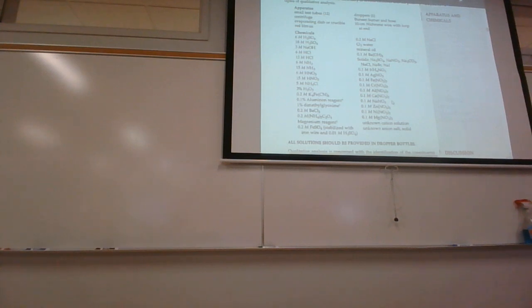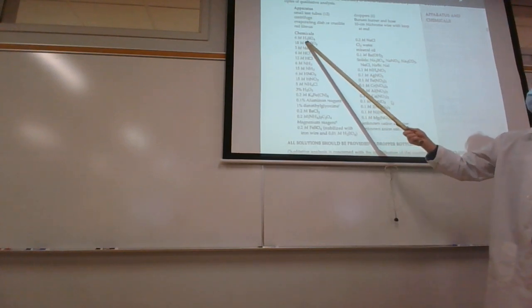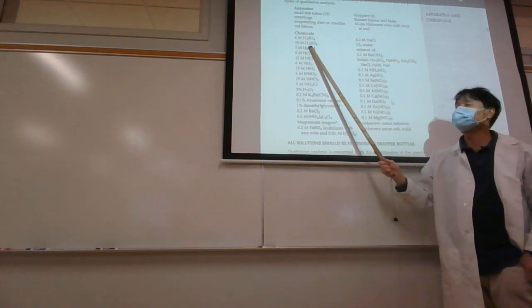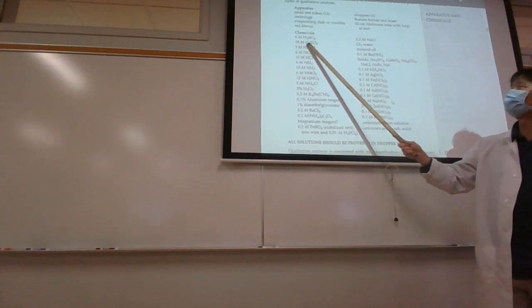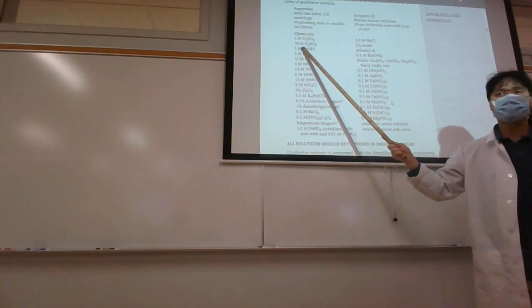Okay, so let's take a quick rundown of some of the chemicals we're using. 6 molar H2SO4 sulfuric acid causes some burns, but when we compare 6 molar versus 18 molar, 18 molar causes severe burns. And this would be equivalent to, let's say, a second degree burn if you spilled this on your skin.